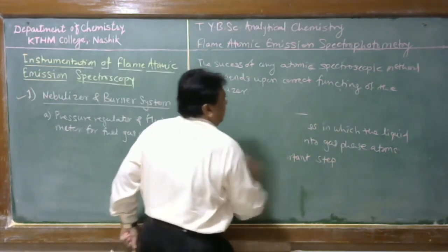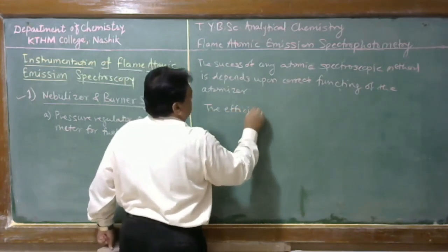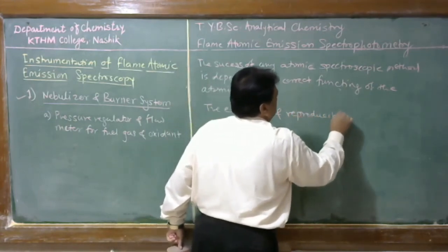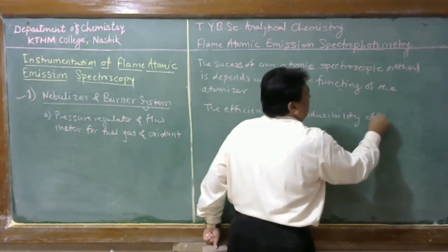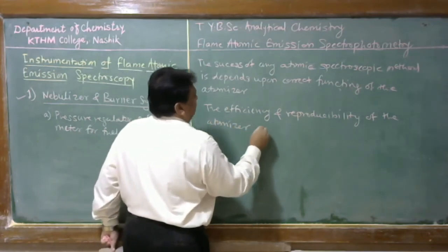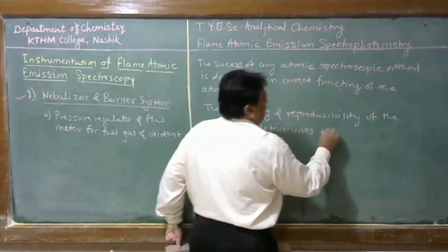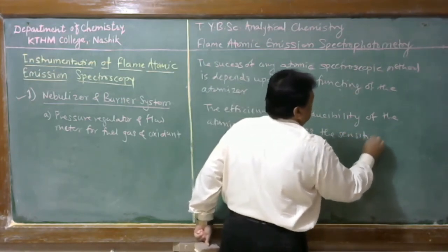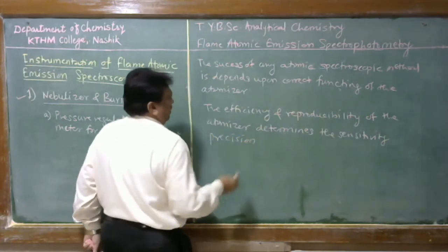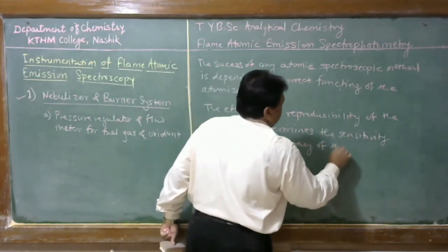Therefore, the atomizer determines the sensitivity, precision and accuracy of the measurement.